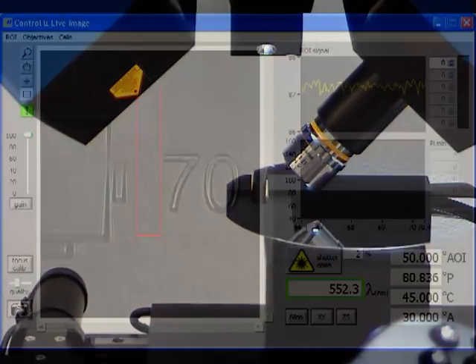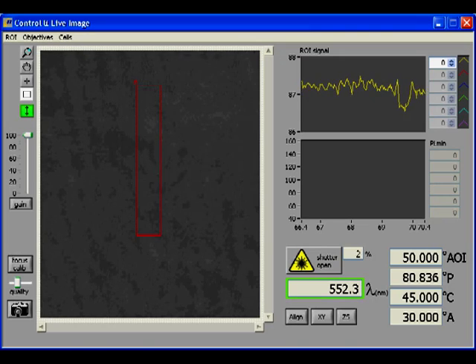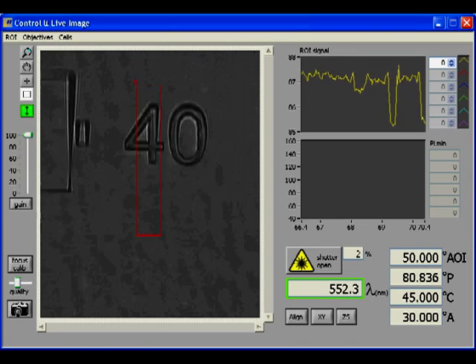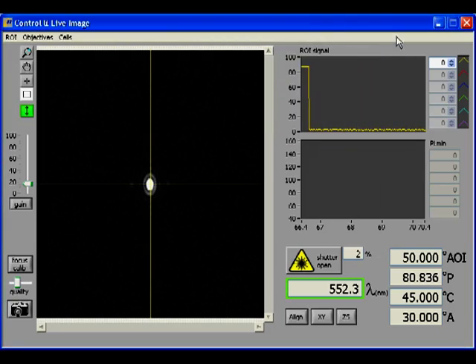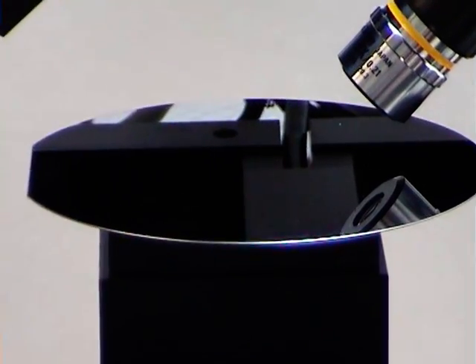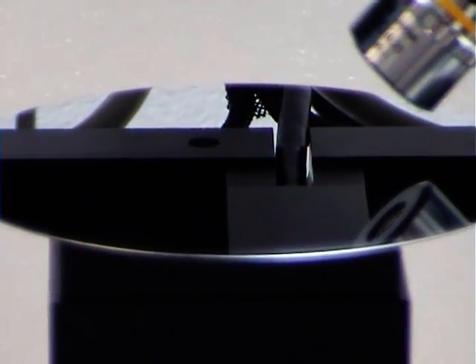The real-time imaging allows you to follow structures in the image and define the measurement range in a simple manner. Alignment and precise orientation of the sample perpendicular to the plane of incidence is easily achieved, either manually or with an automatic stage.